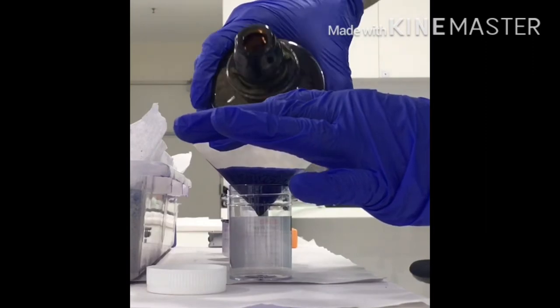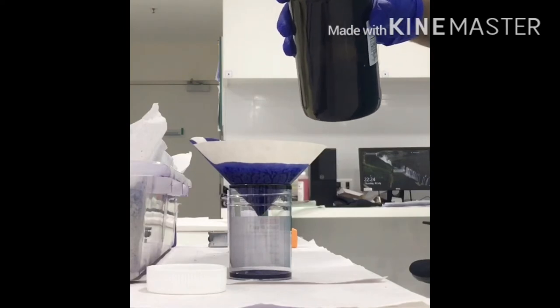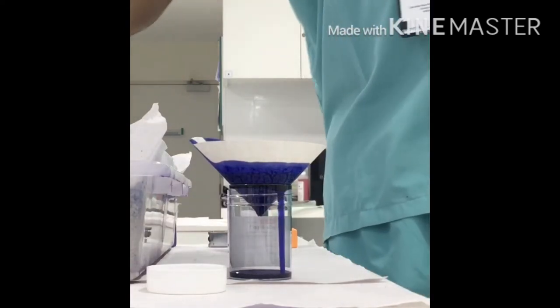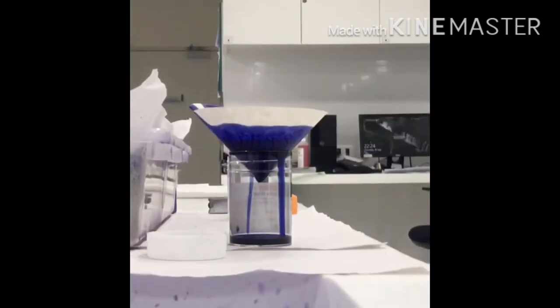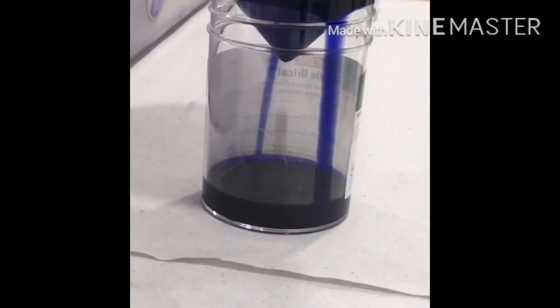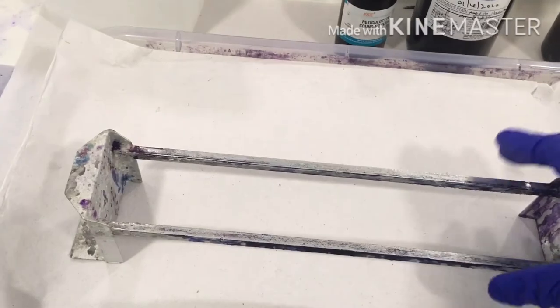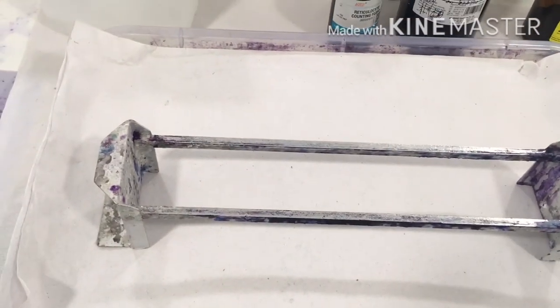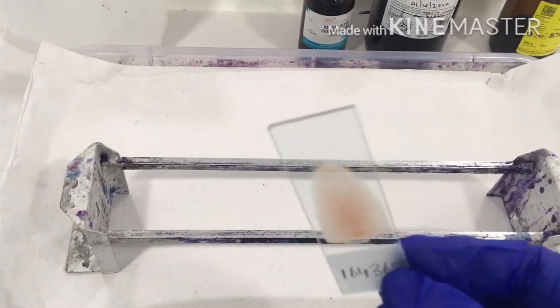So why are we making a peripheral smear? Nowadays everything is automated, we have the help of machines. But even then, when the platelet count goes less than 1 lakh, we have to confirm it by seeing it over the smear. We have to count it manually. For a manual platelet count, and also a DC, whenever the total leukocyte count goes high, whenever we see a high monocyte count or high basophils, in those cases we have to make a smear and confirm that the machine reading is correct before we release the report.